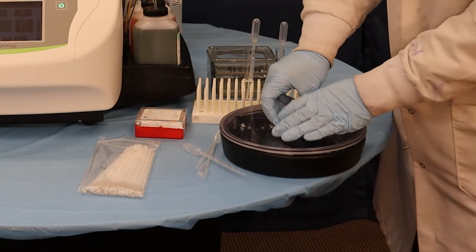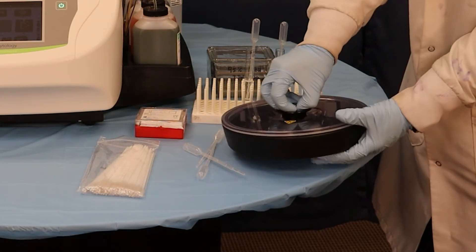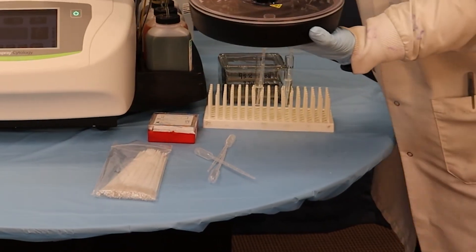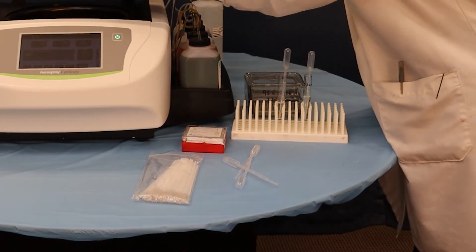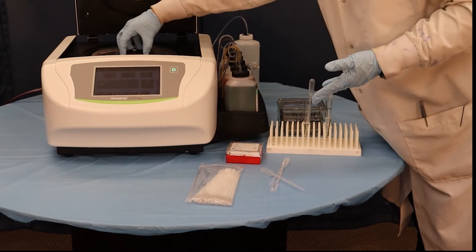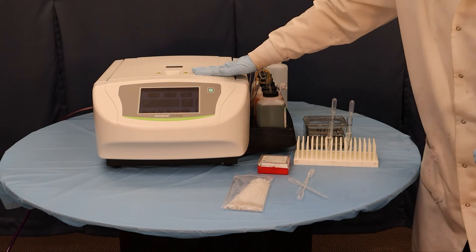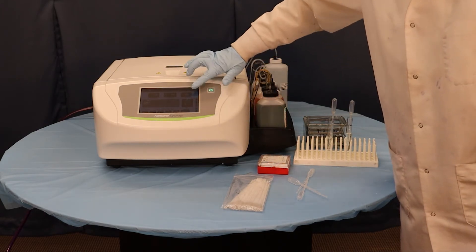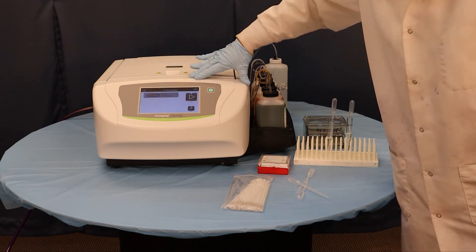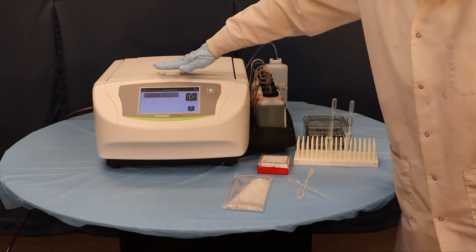We'll go ahead and place the rotor back. Press this in to make sure it's clicked so that nothing's going anywhere. Both sides are balanced. Go ahead and insert it, carrying the bottom into the stainer. Make sure it's mounted a bit off the hub. Then go to the screen — you're going to see a CYTO option; go ahead and select that. We're just going to run the example program that comes with the machine: it's 1000 RPMs and will be five minutes.